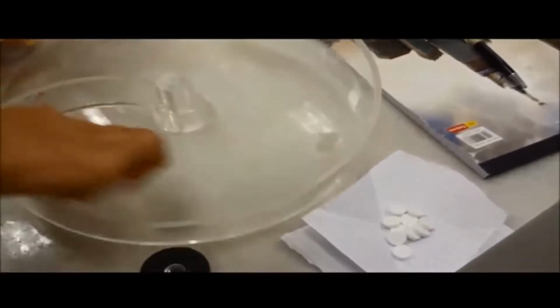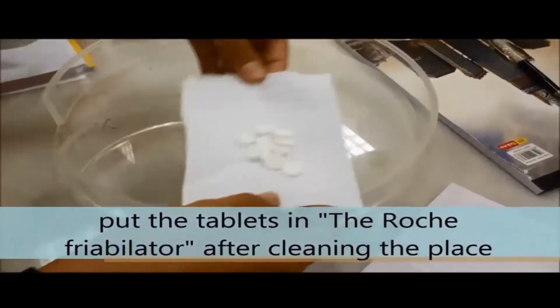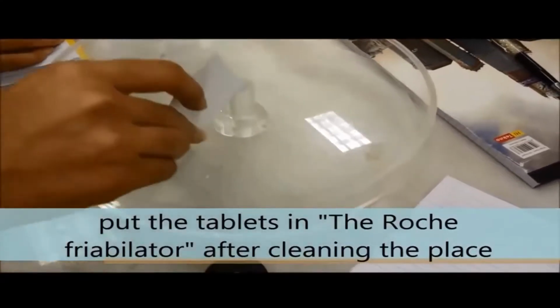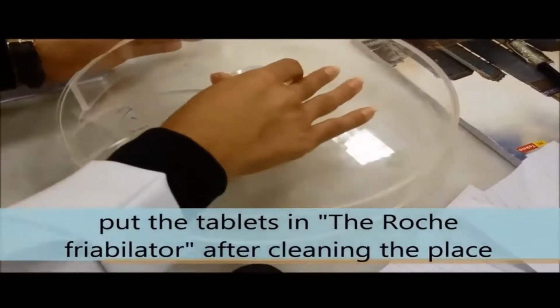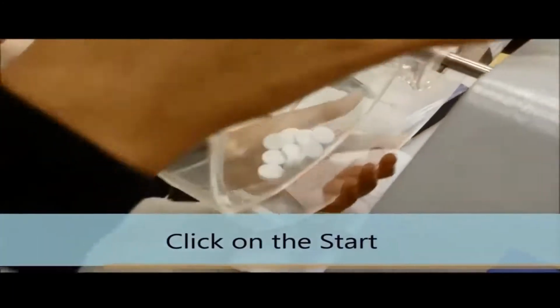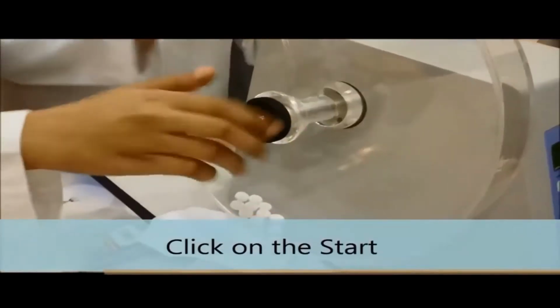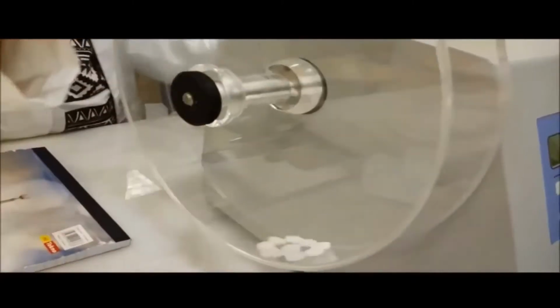This is the test apparatus drum where we need to put the tablets. This is the Roche friabilator. We have to clean it before we use it. We are putting 10 tablets here, and on this drum you can see this one curved projection. After putting them in, we need to click the start button. After the start button, this will run at 25 RPM. We need to fix that.